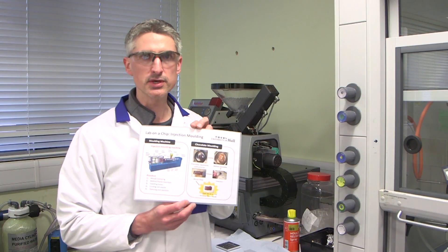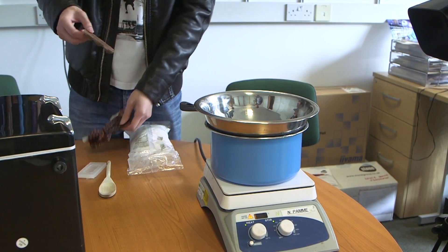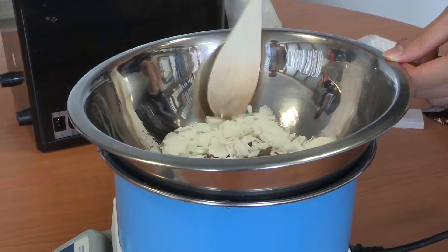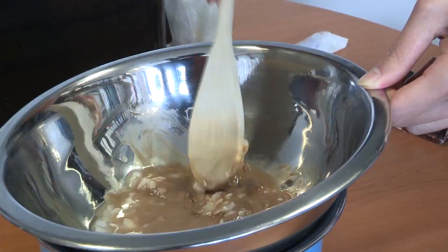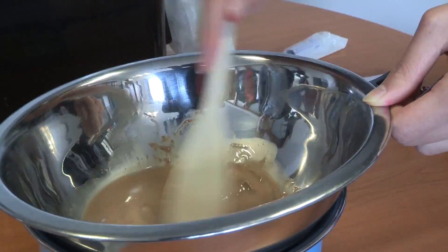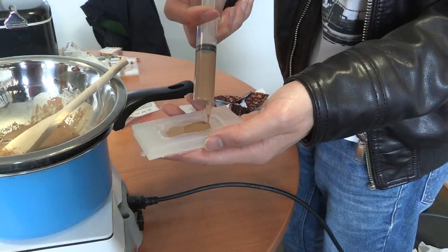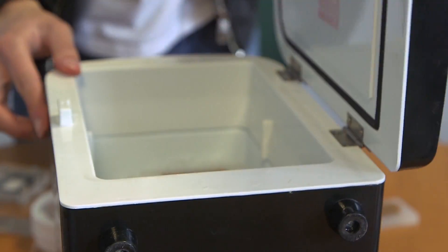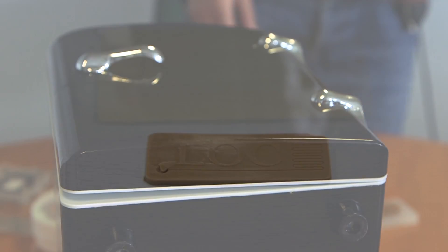One of the ways that we use for making microfluidic devices at Hull is injection moulding. As a model of that, making the silicone moulds and pouring molten chocolate into the mould and then letting it set to create a wafer with a microstructure in it.